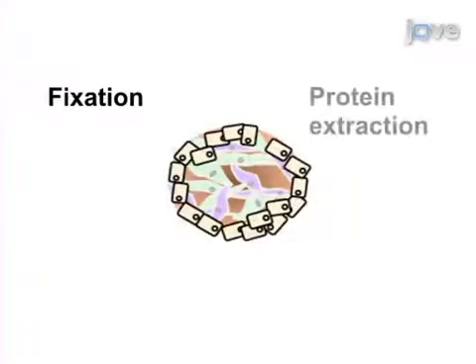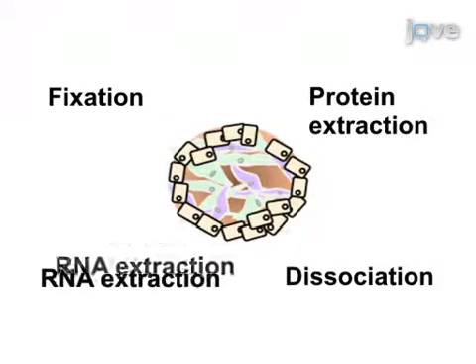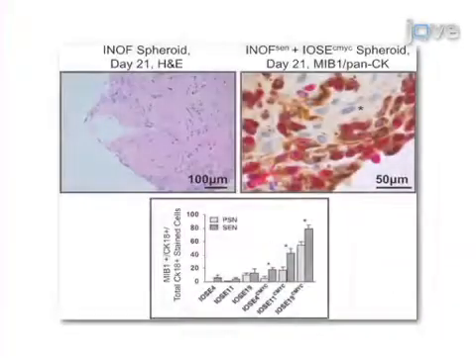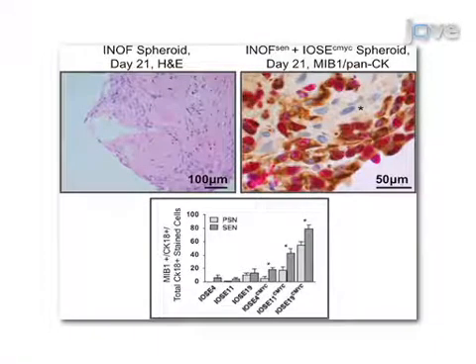Proceed to fix and stain the organoid cultures and analyze expression of specific markers in order to study molecular features of stromal epithelial interactions. Results obtained show how alterations in the stromal cell compartment of 3D heterotypic models can influence the phenotype of co-cultured epithelial cells.